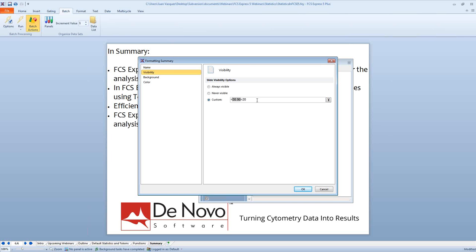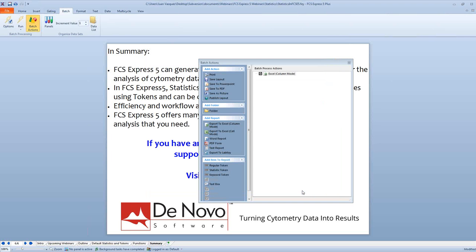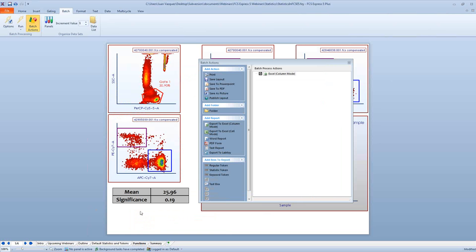Put the equal sign there too. Okay. So now if I go here, let's shrink that. You can keep your eye on the summary tab down here. You can see it disappears when it hits below 20. Okay. If it goes back up, you'll see it reappears here in my page tab.